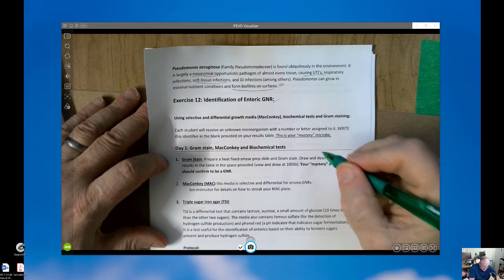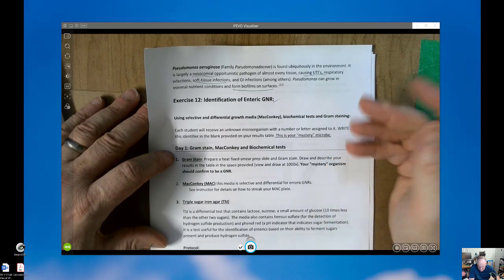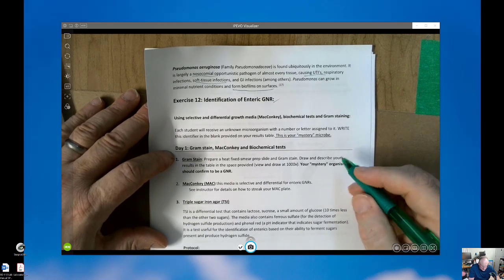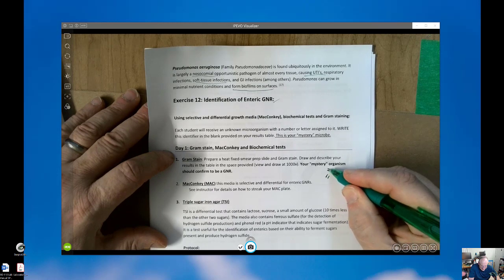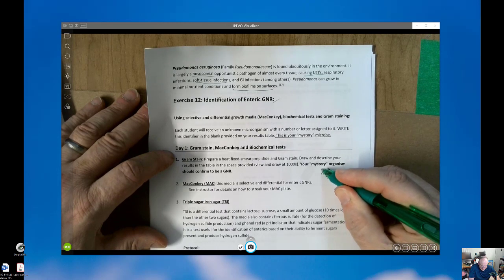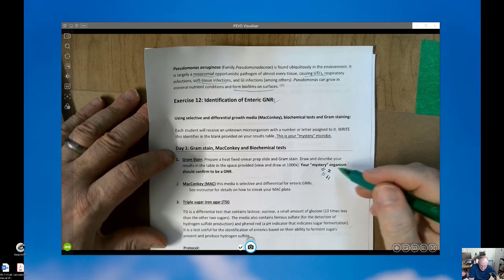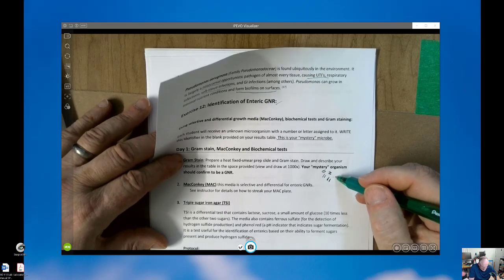So let's make it a thought experiment and do a gram stain. And obviously what you want to look for are pink, short, blunt rods. E. coli under our microscope look like equal signs. It's really strange. They kind of line up next to each other, and you'll see just a preponderance of these types of things. E. coli does that pretty nicely.